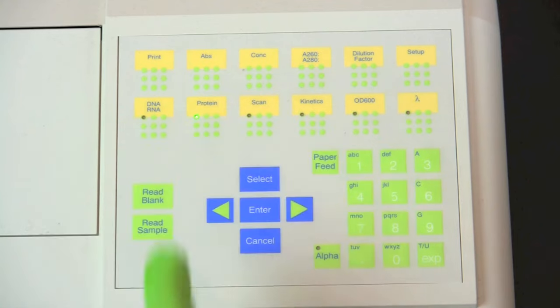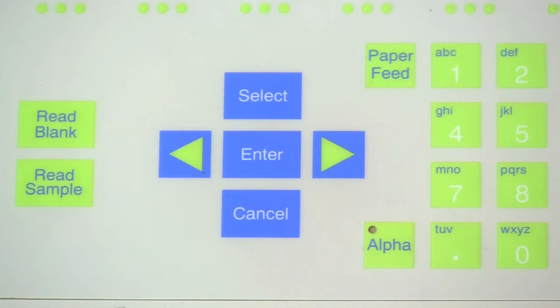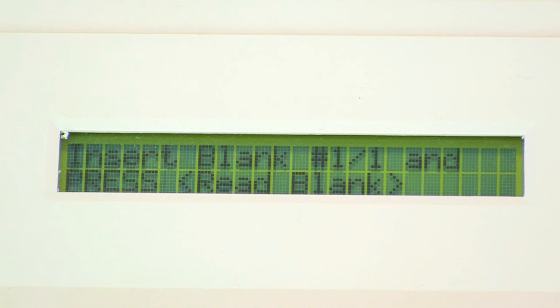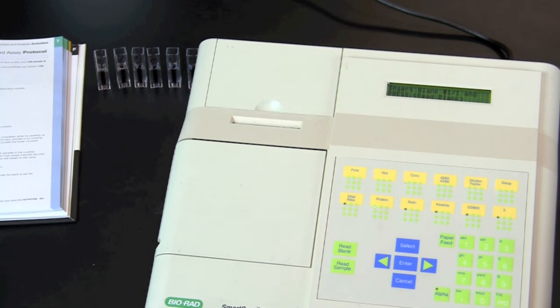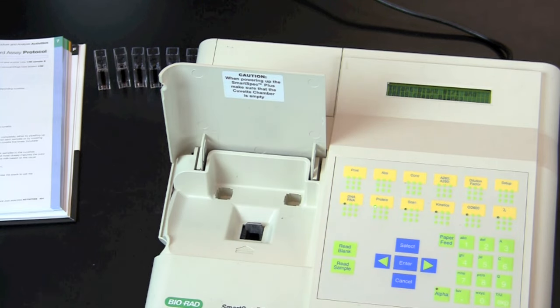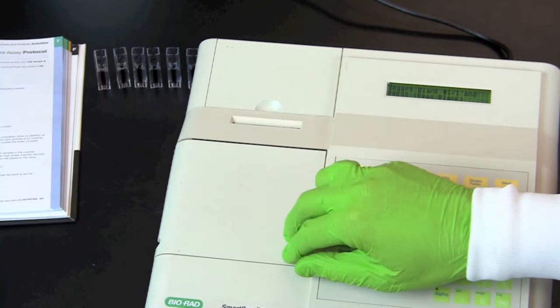To determine the protein concentration using a spectrophotometer, select for the Bradford assay. When asked to insert blank into the spectrophotometer, insert the cuvette labeled control. Use the blank to set the spectrophotometer to zero absorbance, or 100% transmittance.